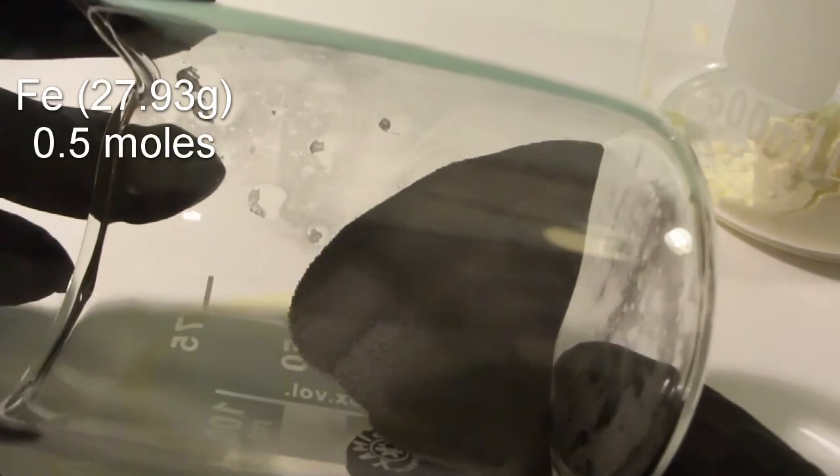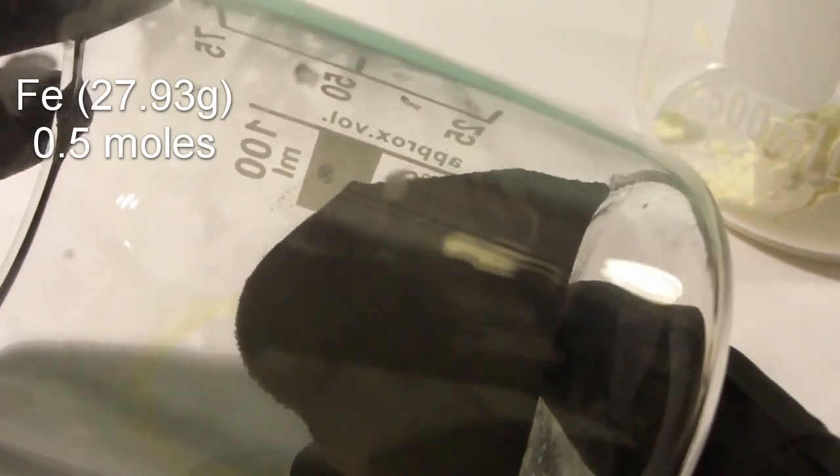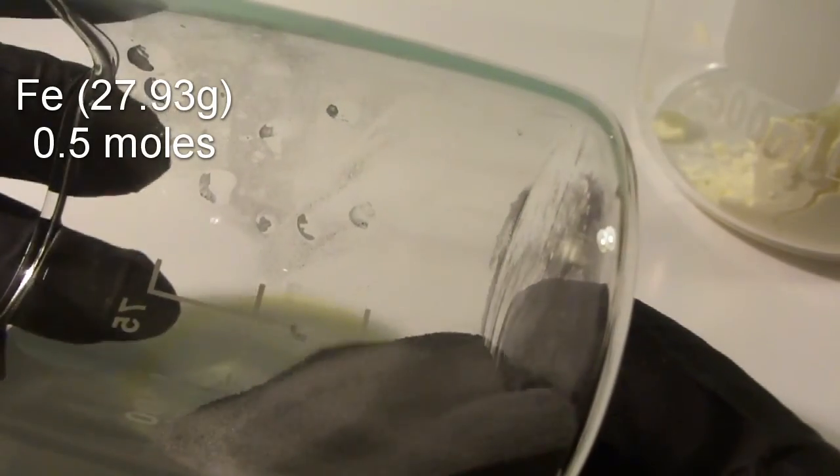Start by measuring out 27.93 grams of fine iron powder. As you can see, it is a dark, free-flowing powder.